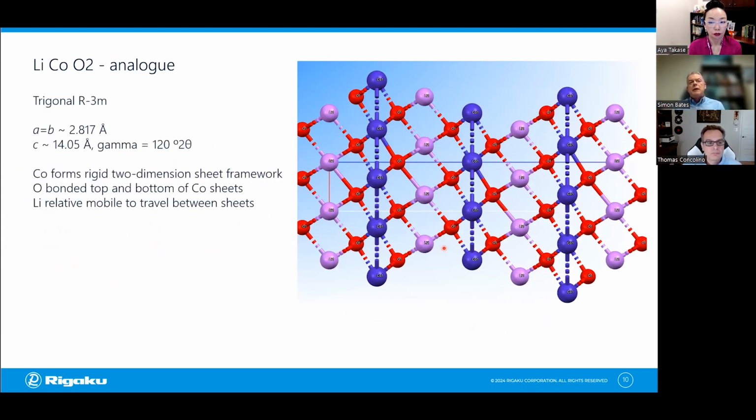So this particular material, if you view it from traditional crystallography, it's a trigonal structure. It's R-3m, or R bar 3M, depending how you like to read that. It's essentially a hexagonal structure. And we have lattice parameters that define that structure.